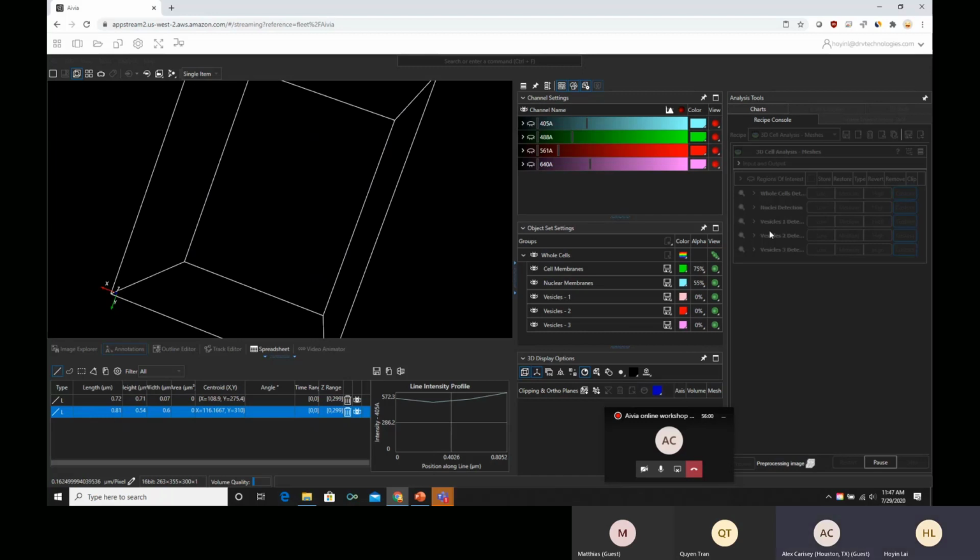Yeah, definitely setting the right ROI for the parameter determination is pretty important for this recipe. Or the alternative is that you can just turn off the ROI and do it on the entire image. Since this is a relatively small image, it wouldn't take too long. But imagine you have a data set that is a couple of gigabytes or even tens of gigabytes.